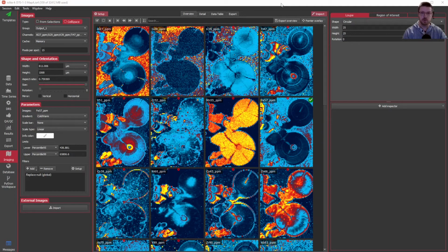Okay, so the last example we're going to do today is a little bit different. We're going to try to create a magnifier so that in the inspector widget, we're going to have a blown up version. We're going to have a zoomed in area from around the inspector. So to do that, I will go to add inspector, Python, add. I'll call this magnifier. I'll just base it off of our previous one.